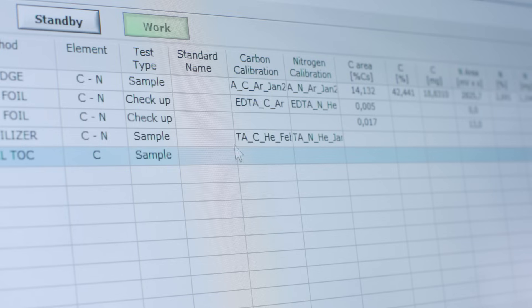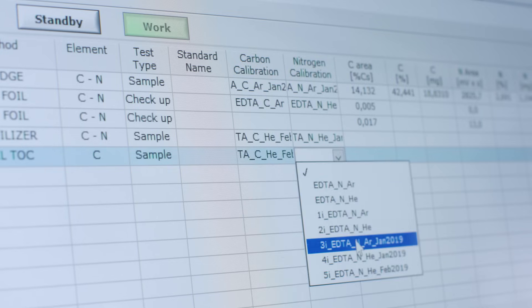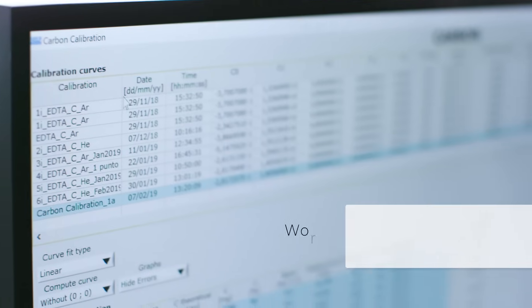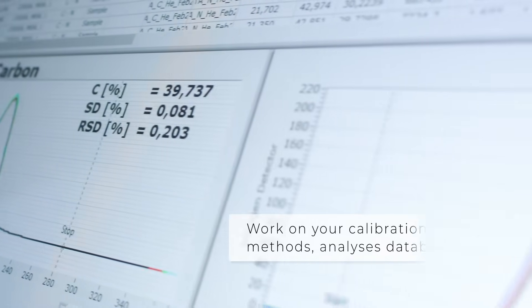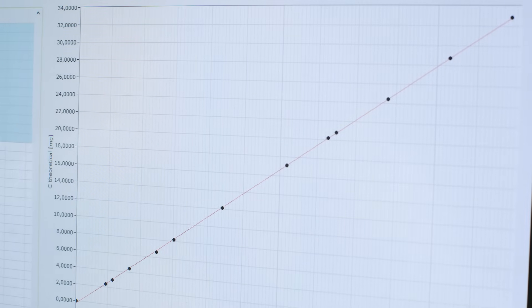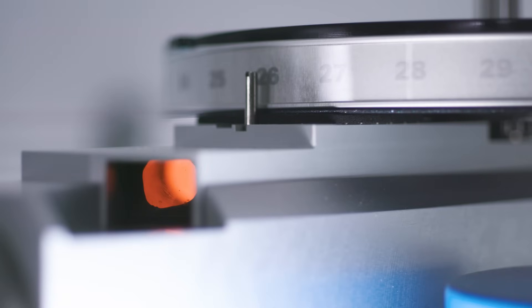Choose from a full library of pre-installed methods or create and save customized methods. An easy calibration curve creation for carbon and nitrogen allows for testing of any sample matrix with no memory effect. Select your sample and press start to begin the analysis.